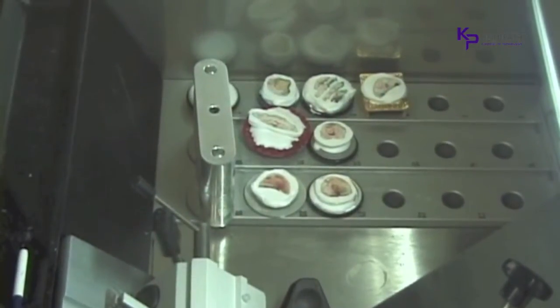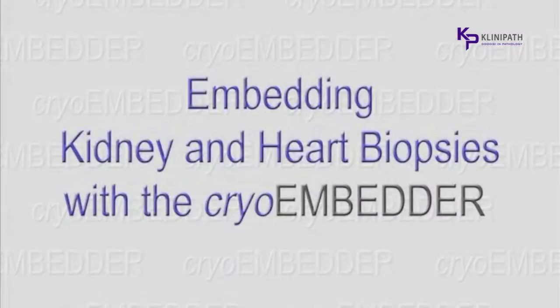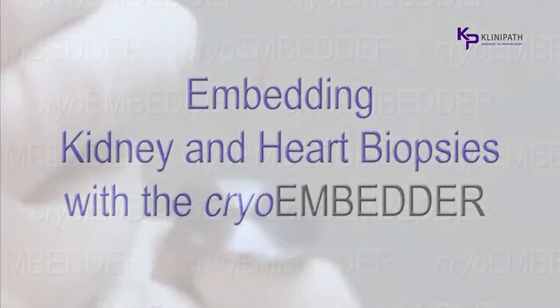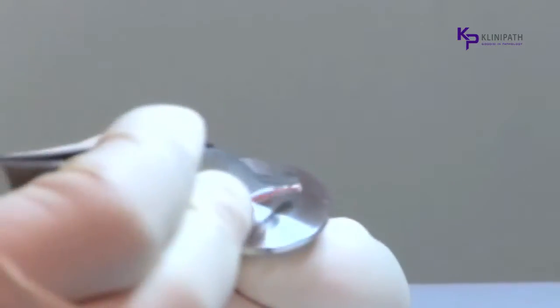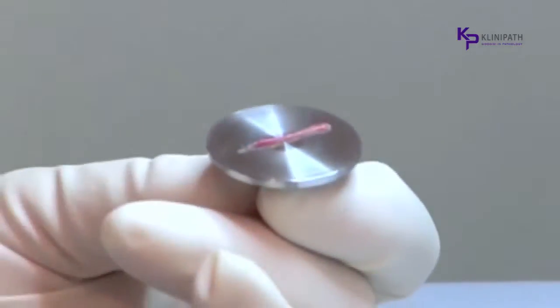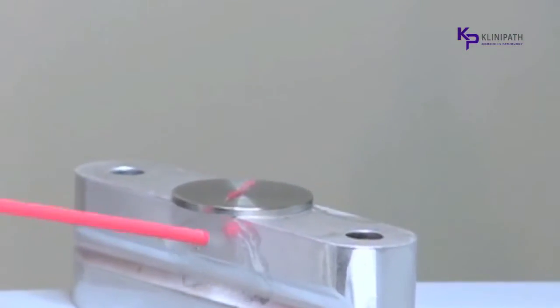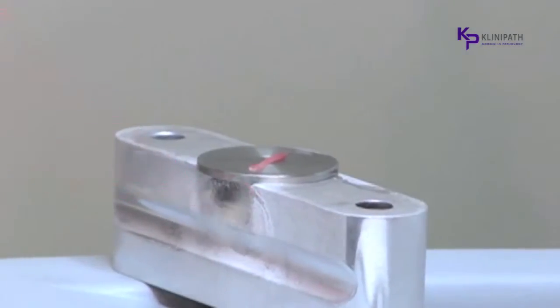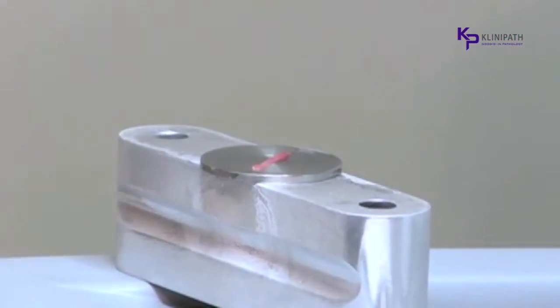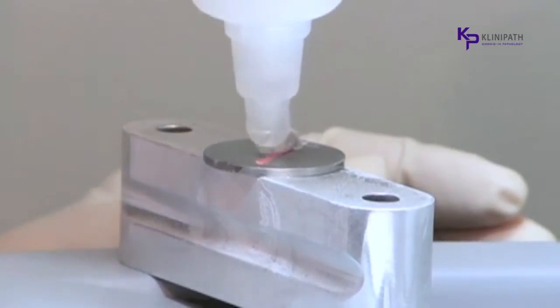Because tissue is mostly composed of water, it is the moisture in the specimen that will cause it to adhere to the cold disc. The Cryoembedder has solved the problems associated with processing needle biopsies. The specimen is placed on the smooth disc and easily manipulated to lay on a flat plane. The embedder gently extracts the heat from the tissue to avoid freeze artifact. A technician can consistently cut dozens of full face sections on very small tissue samples without cutting away valuable portions of it.